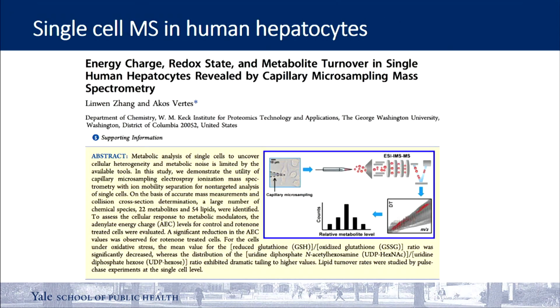So this is another paper that I found very interesting, and I would really like to share it with you. Again, this is on HepG2 cells, on single cells, but essentially in this particular case, you can apply pesticides to these cells, and then you can monitor the changes that occur in the redox state and also in certain molecules within the cell.